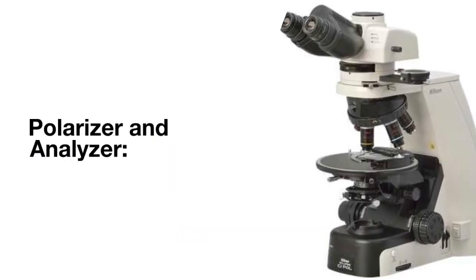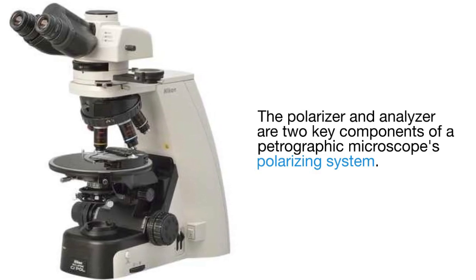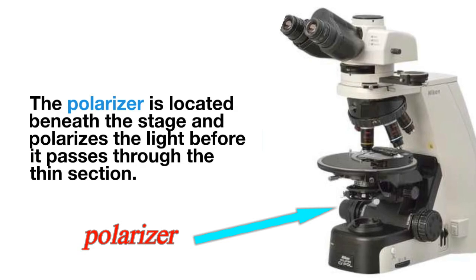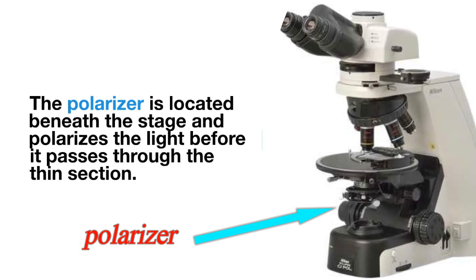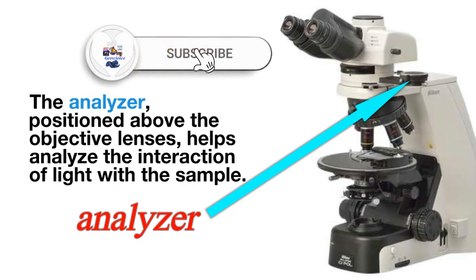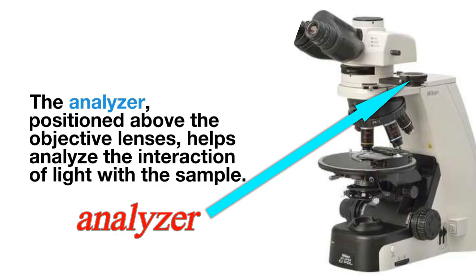Polarizer and analyzer. The polarizer and analyzer are two key components of a petrographic microscope's polarizing system. The polarizer is located beneath the stage and polarizes the light before it passes through the thin section. The analyzer, positioned above the objective lenses, helps analyze the interaction of light with the sample.